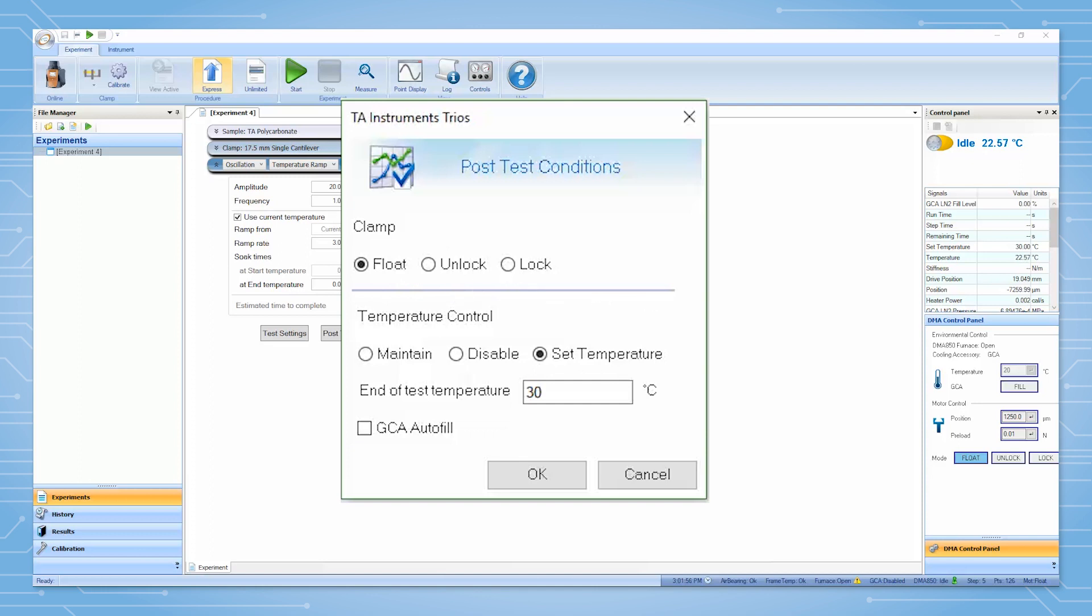The temperature control can be set to maintain the final temperature, disable the temperature control, or set final temperature to go to the temperature in the field below at the end of the test.